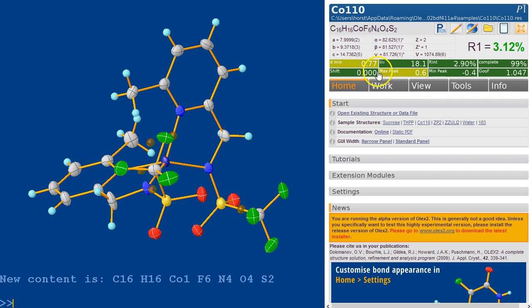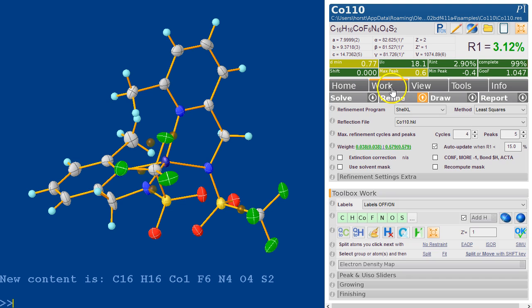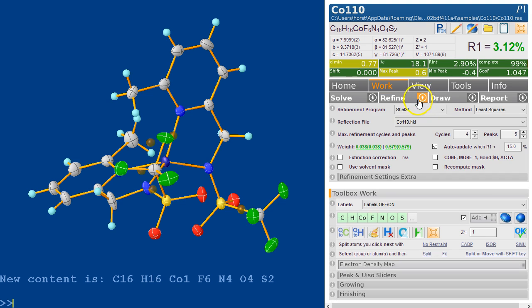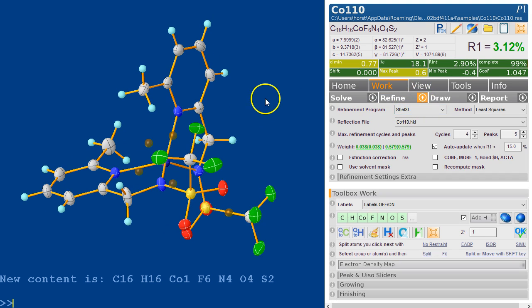We want to work on the structure, so we go to the work area here and we have the solution settings and the refinement settings. Let's just concentrate on the refinement. There are a number of options.